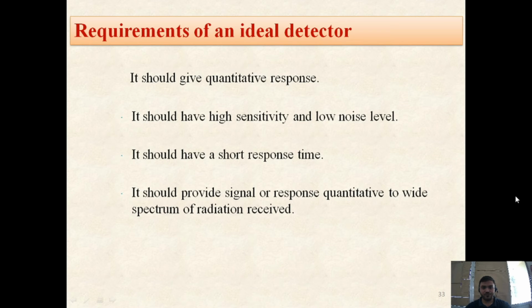Requirements of an ideal detector: it should give qualitative and quantitative response. It should have high sensitivity and low noise level. It should have a short response time. It should provide a signal or response proportional to a wide spectrum of radiation received.